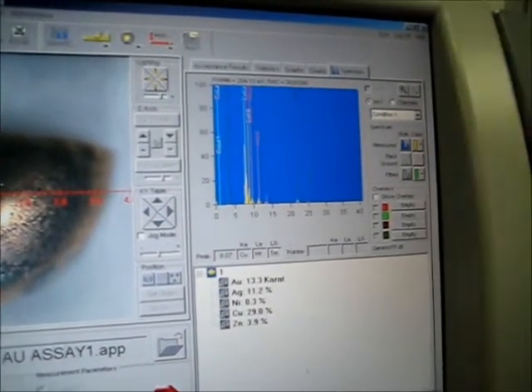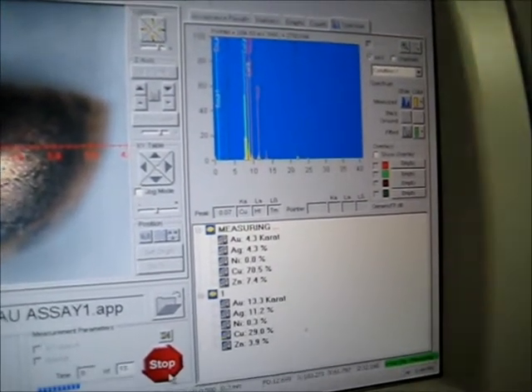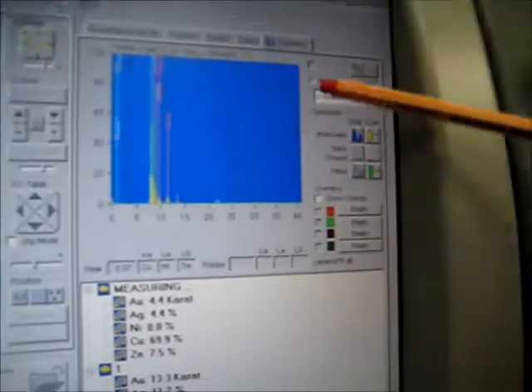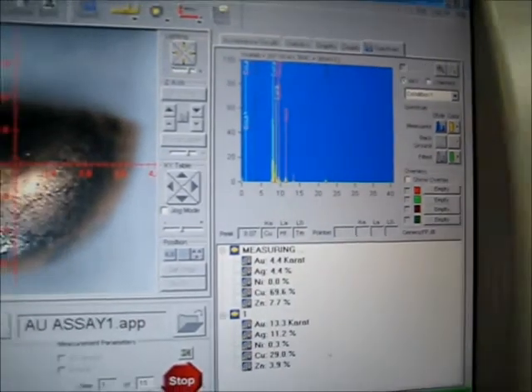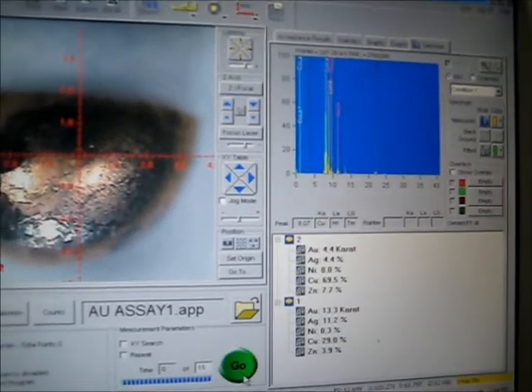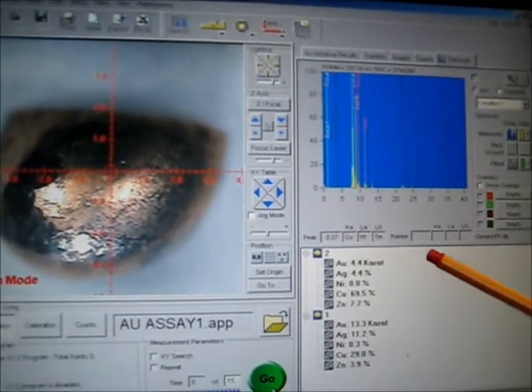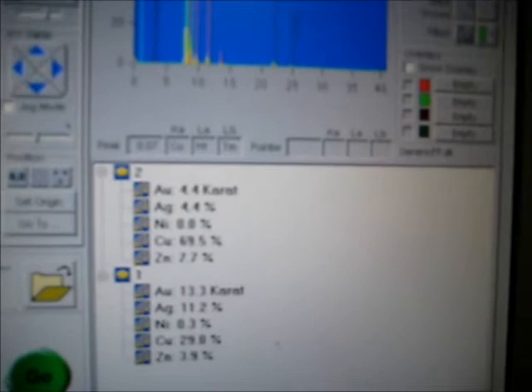In a few seconds you get already live results and you see a spectra of the sample. In 15 seconds you get your final reliable results. The unit for gold can be chosen between carat and percentage. That's all.